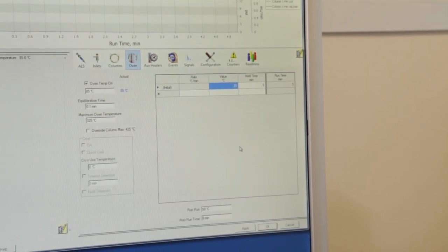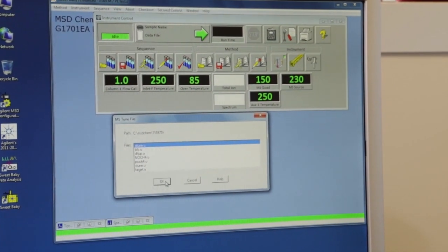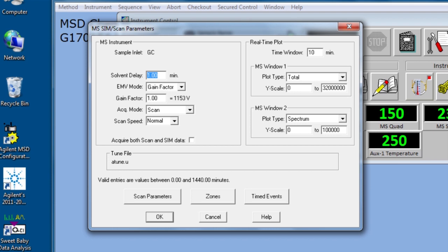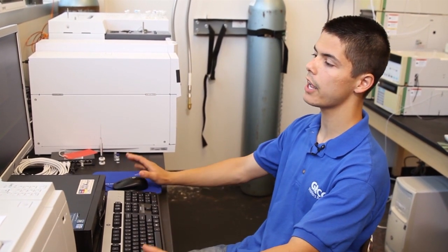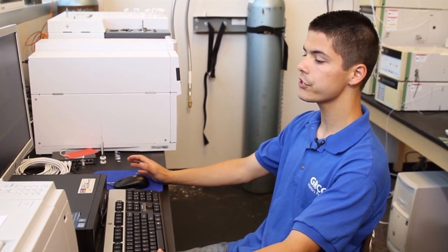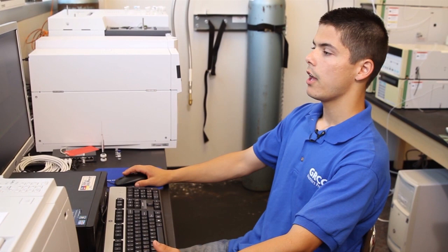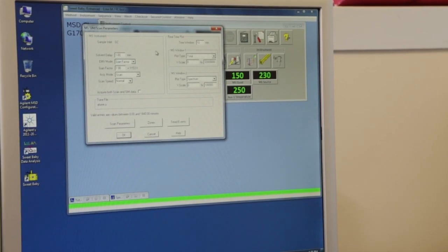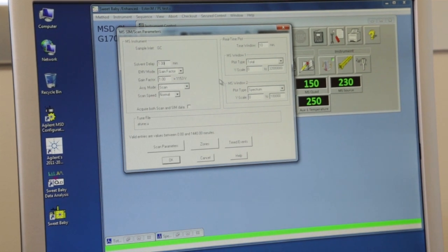After you've set the temperature and any ramps, you can just hit OK. The next important screen shows MS, SIM, and scan parameters. The first thing you're going to look at is your solvent delay. The solvent delay helps the instrument avoid reading the solvent in your graph. Most solvents will boil at a lower temperature than the actual sample, so you can delay when the instrument starts reading until after the solvent has already passed through the column. I have the solvent delay set at one minute, which is pretty typical and fine. You can leave that.